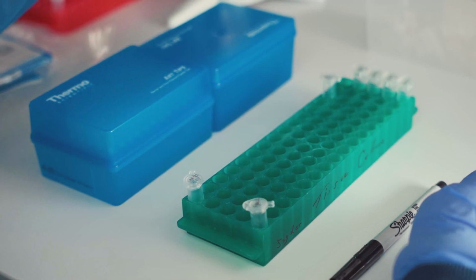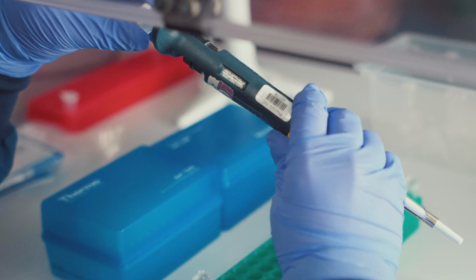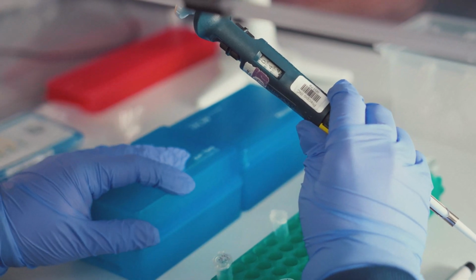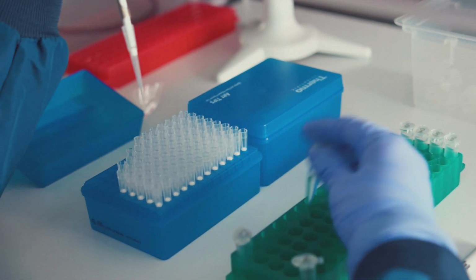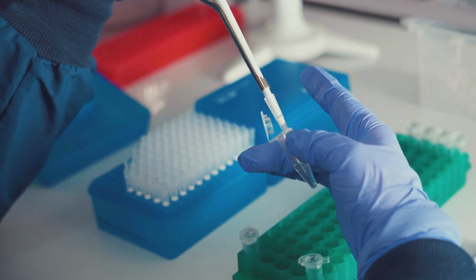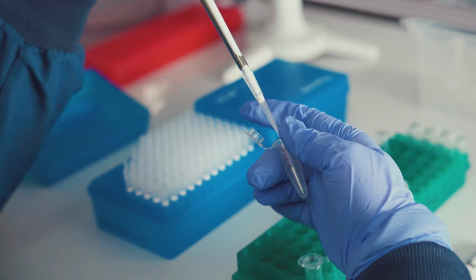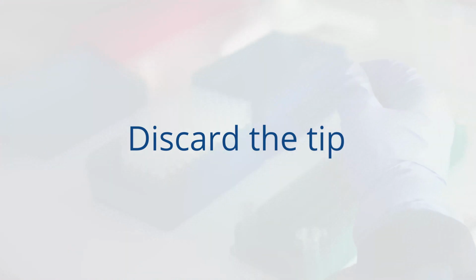Next, what you're going to do is prepare the TE buffer for the solution. You're going to make sure that you get as close to the nearest decimal as possible. Once your pipette tip is set to the appropriate volume, you're going to put your pipette tip on and obtain the TE buffer. That TE buffer is going to go into your empty labeled tube. Once you've dispensed the TE buffer into the empty tube, you can discard the tip.